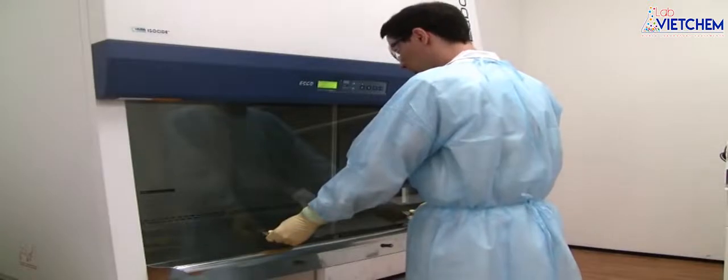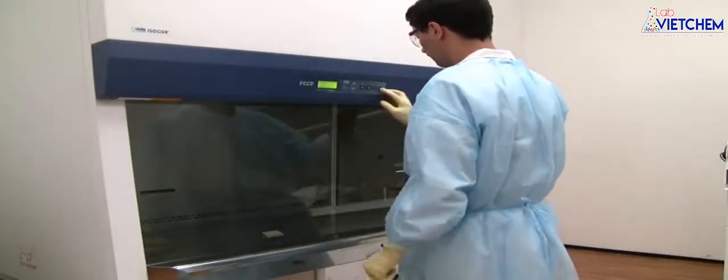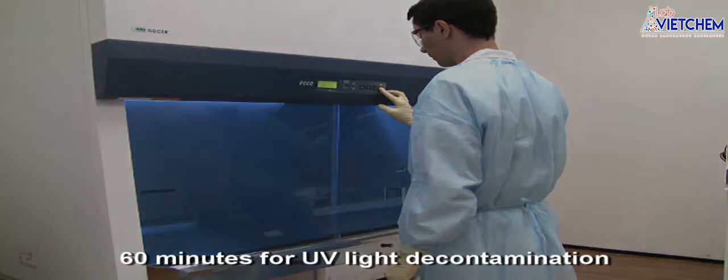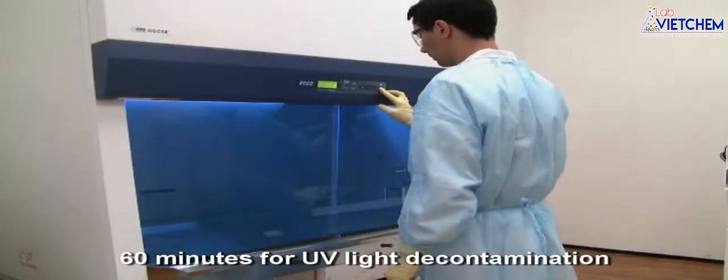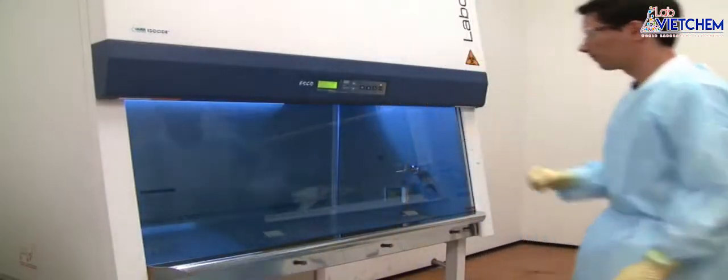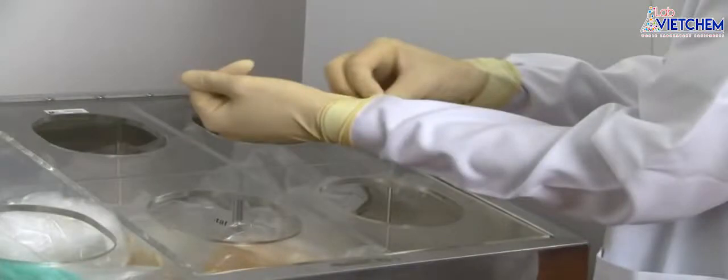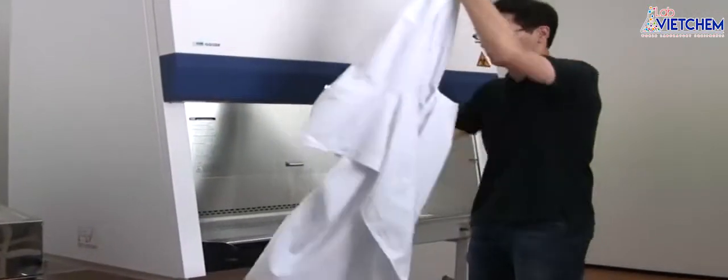Depending on the laboratory protocol, now you can shut down the cabinet, close the sash window, and turn on the UV lamp. The most effective amount of time for UV light decontamination is around 60 minutes. Some facility protocols specify cabinets should be operated continuously. Degown properly by removing and disposing your gloves and removing your lab coat. Wash your hands and forearms with germicidal soap and water.